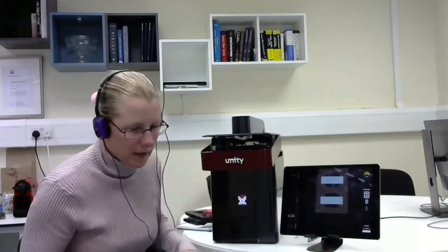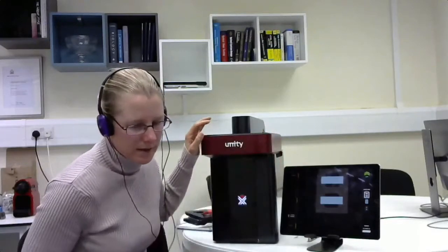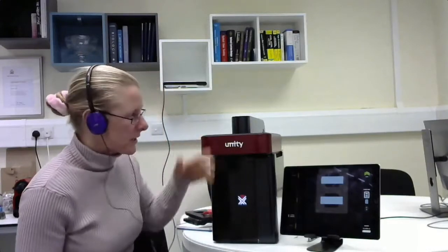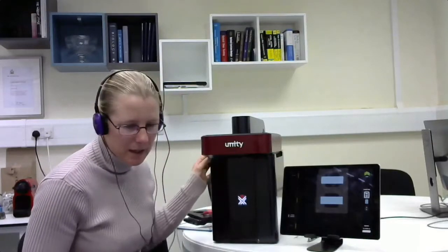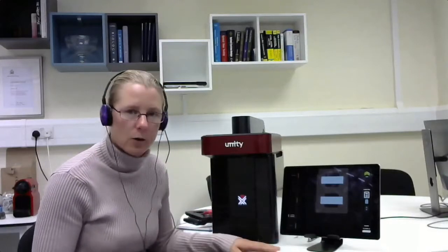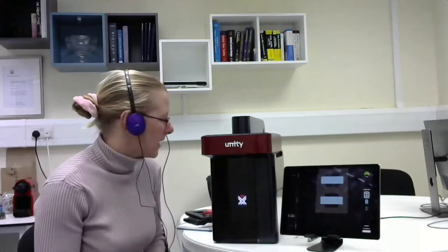This means our XY stage doesn't have to be as bulky as your normal microscope stage on a traditional inverted microscope. It's very small and doesn't output much heat or power - it just needs to move the sample holder around. The system closes up to make it light-tight, so you don't need it to be in a dark room. As you can see, it's just in our normal office with the lights on. There is inbuilt dampening inside between the instrument and the stage, so you don't need to put it on an optical table.